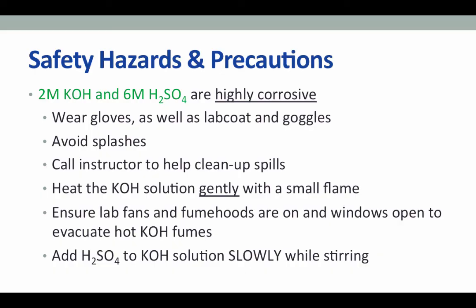And lastly, when it's time to add your sulfuric acid to your potassium hydroxide solution, add it very slowly and be stirring as you add. You may need to use a lab partner here, where one person is pouring while the other person is stirring.